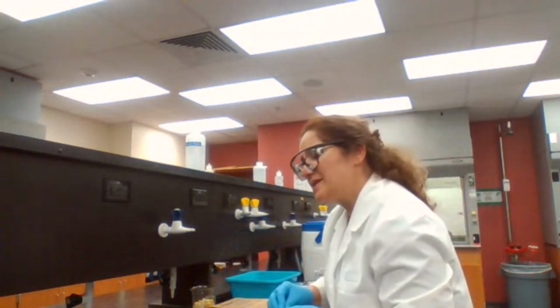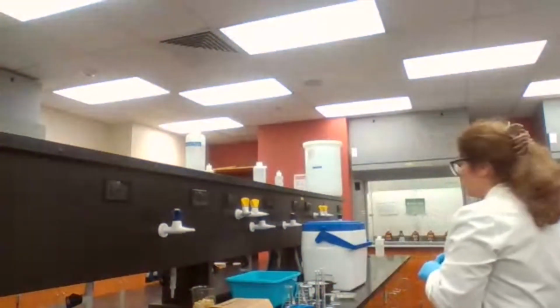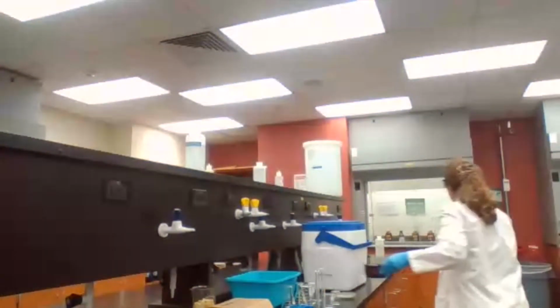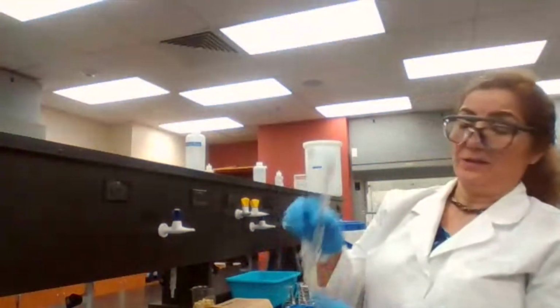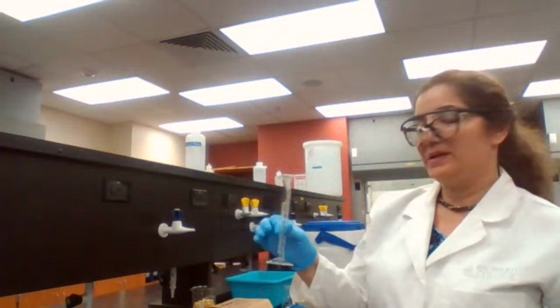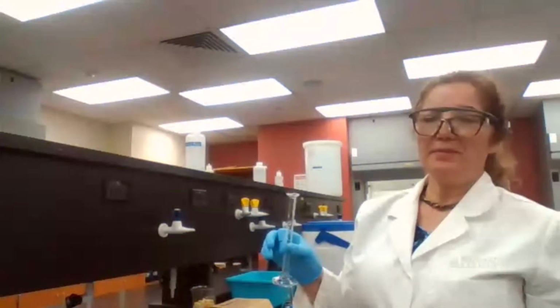Sulfuric acid, ice it, and then add 0.4 milliliter of methyl benzoate. I'm going to take the acid from Cupid and bring it here. I will be right back. For the 0.4 milliliters, I did not use a graduated cylinder. I only used the dropper because 1 milliliter is about 20 drops.